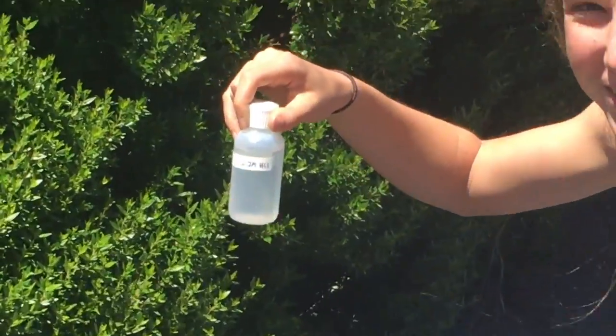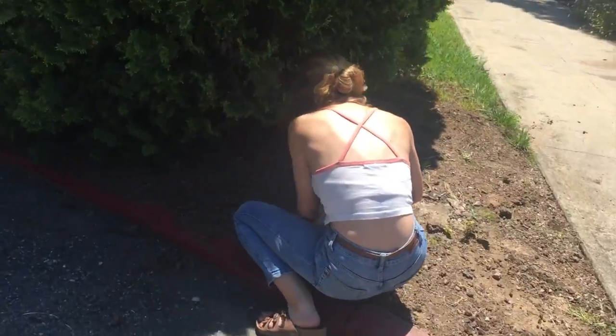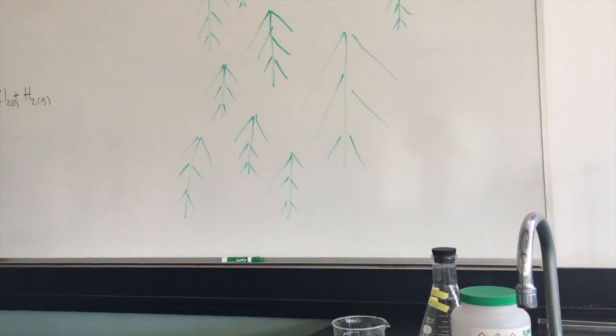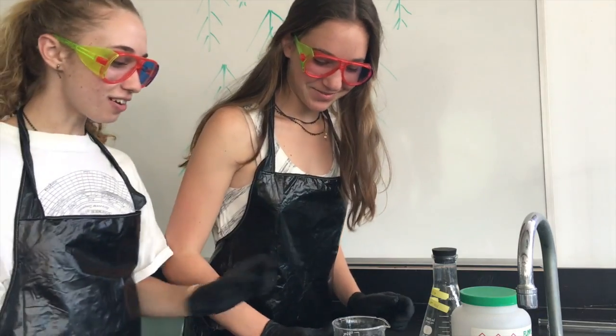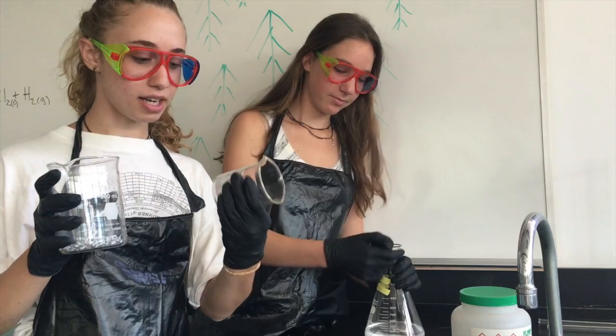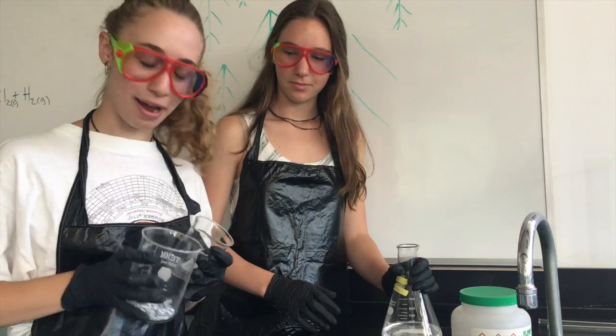Look at that, folks! Tin 2 chloride, straight from nature. Straight out of the ground, some zinc! Now that we have our dishwashing clothes on, let's make sponges. Alright, so first I'm going to get our mossy zinc here in this beaker, and I'm going to pour it to cover the bottom of our camping beaker. I guess I'll use the spout.